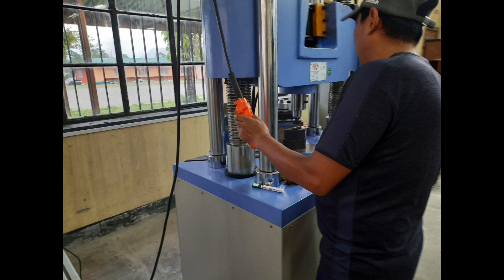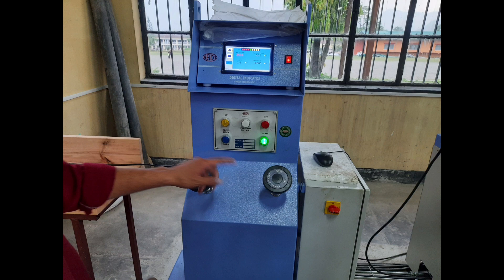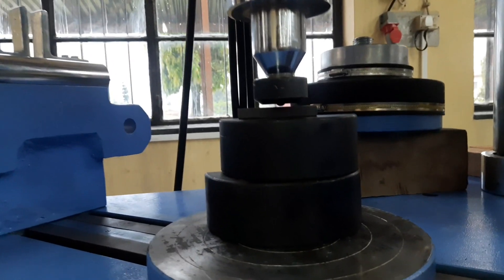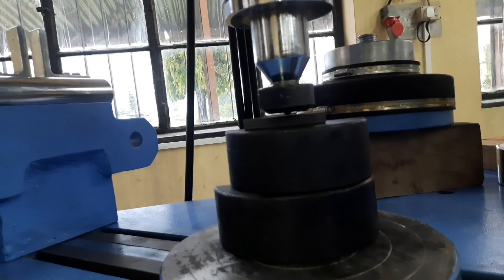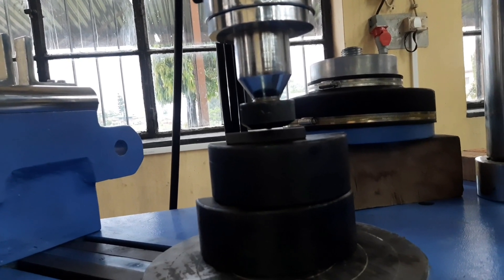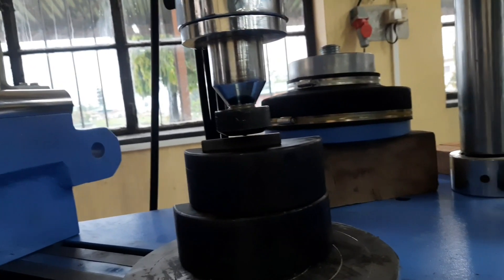The desirable load for the hardness testing is set on the digital screen. Once the specimen gets loaded, adjust the load by turning the left-hand valve clockwise or anti-clockwise. Clockwise rotation increases the load and anti-clockwise rotation decreases the load. The load is set at any preset load requirement.